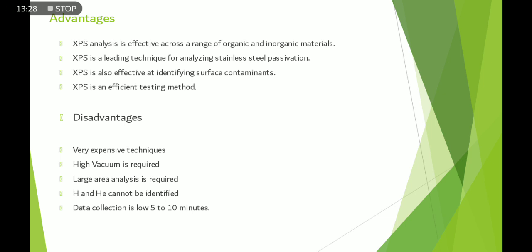So that's all from my side. In this technique, we basically say that this is an X-ray technique which is used with ejected electrons, electron beams, and a sample. That's all on this X-ray technique. So that's all from my side.